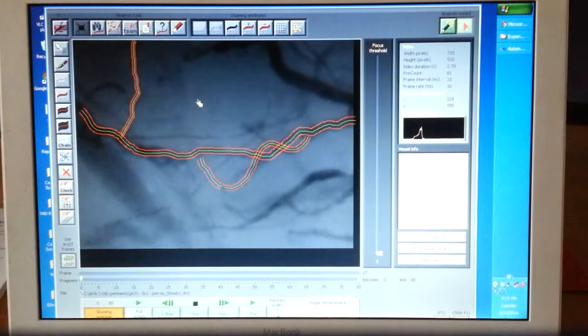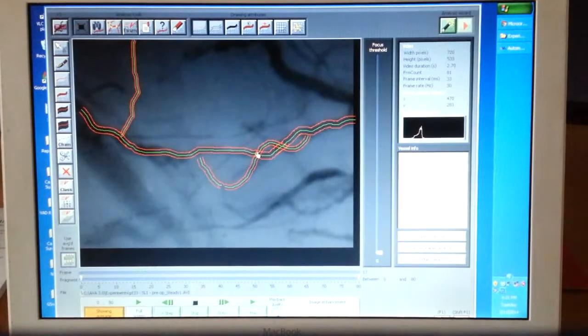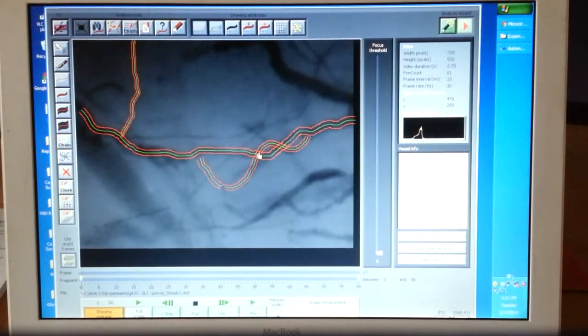All right, so now, once you do make a little bit of progress, you obviously want to save it because this software is not foolproof. There are times where it'll crash, and if you haven't saved it, you might have done all the analysis, you might have drawn all the vessels and everything, then it crashes and you lose everything. Don't want that to happen to you. It's happened to me, and I figured out a way to basically more or less save your work.